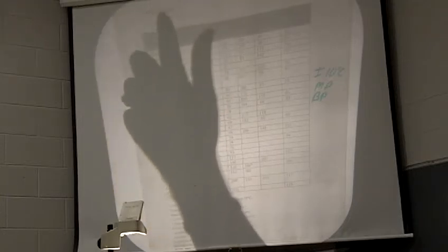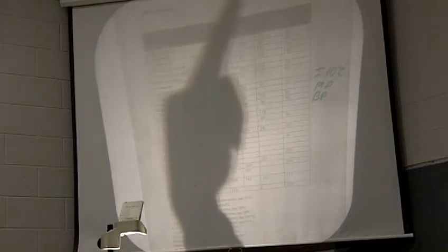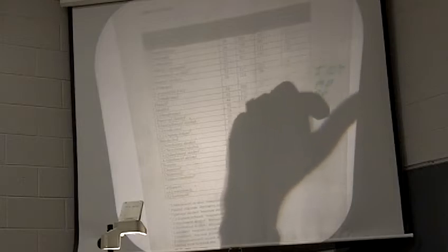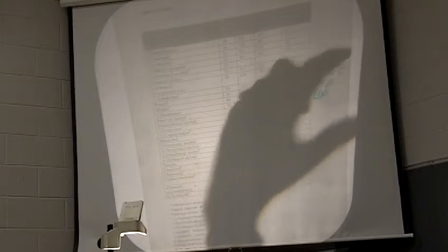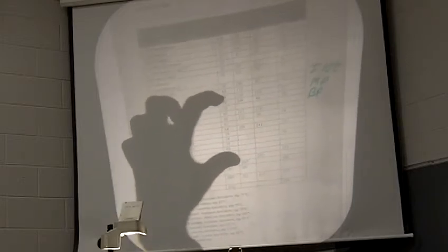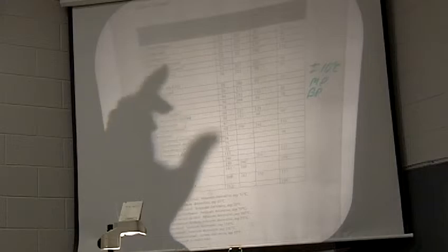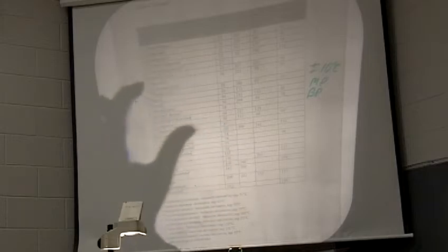Find that set of tables. Then you need your melting point or boiling point, and you want to look in the range of plus or minus 10 degrees of that. Look at the possibilities for an unknown, and then you're going to look up the IR spectra of these, match your IR spectrum with one of these, and then you'll have what your unknown is, okay?